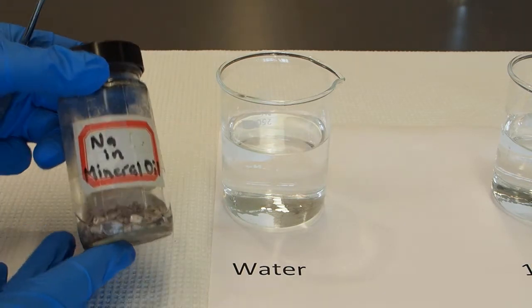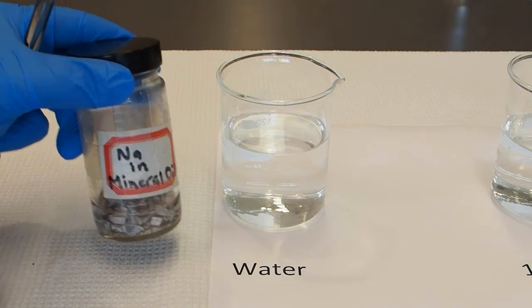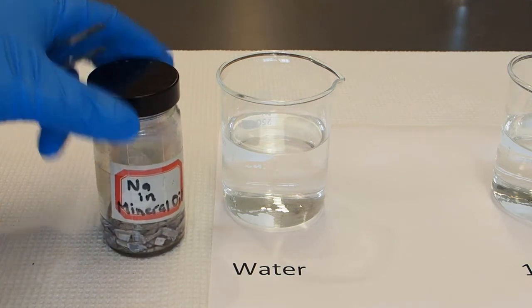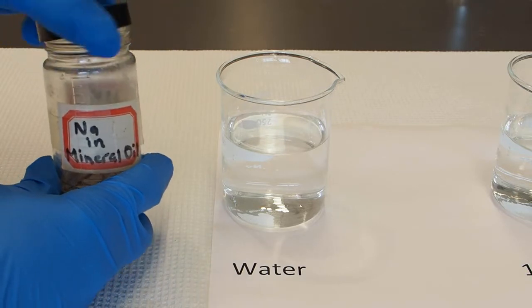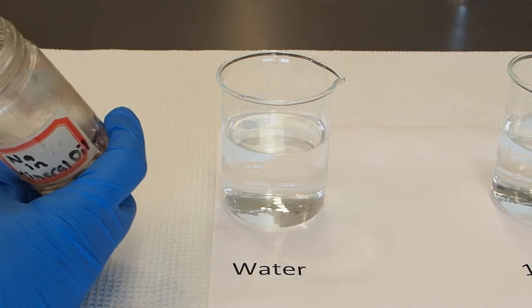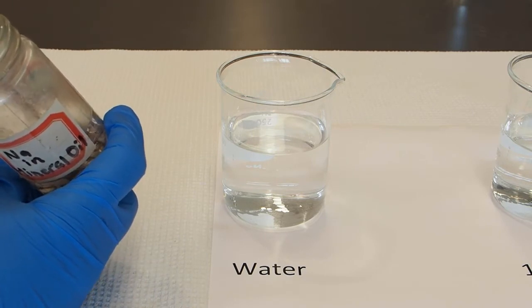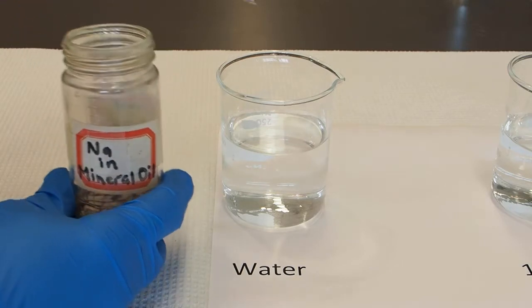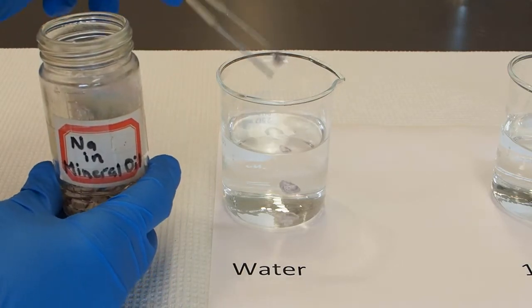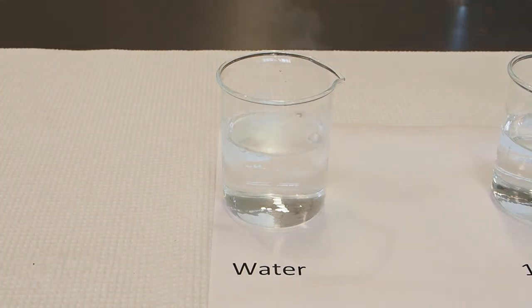Sodium is stored in a bottle underneath mineral oil. The reason for that is it actually reacts with constituents of air, both the oxygen in the air as well as water in the air, as we'll see in a second. So I'm going to take a couple of chunks of sodium and add it into the water. It takes a moment for the mineral oil to be released.